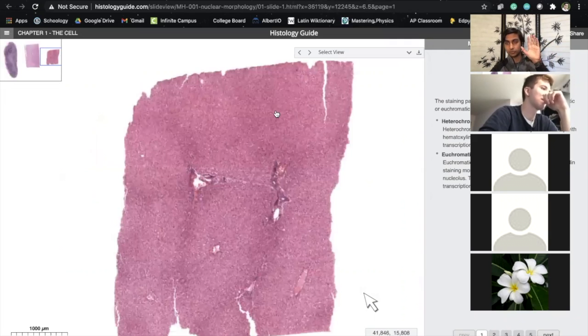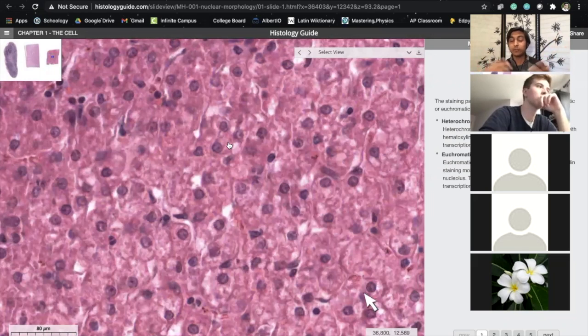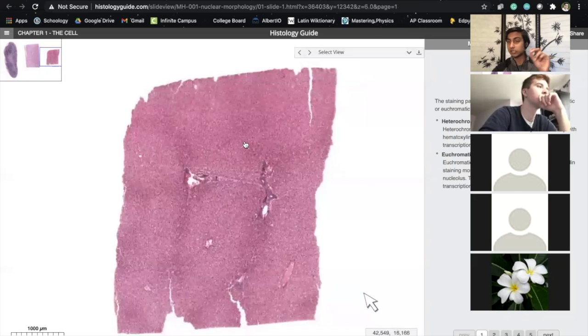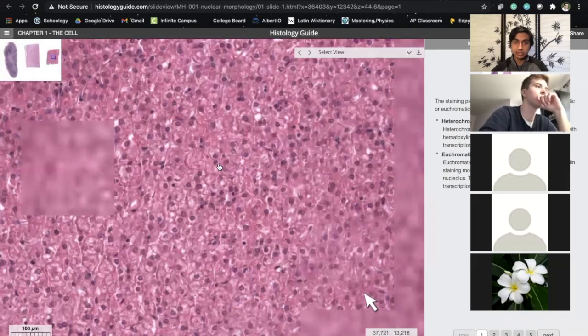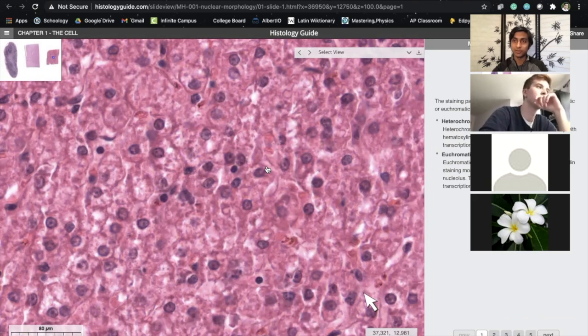Here is a tissue sample from the liver, a human liver. We can zoom in and actually see what the cells look like inside. This is the fundamental of what histology is. Whenever you're looking at it, it won't necessarily look like this, but when you zoom in, you'll see those individual cells, and they'll all look different depending on what organ or tissue you're in. But here you can see the example of the liver. I want everyone to identify what they're looking at here. Okay, we have two colors.